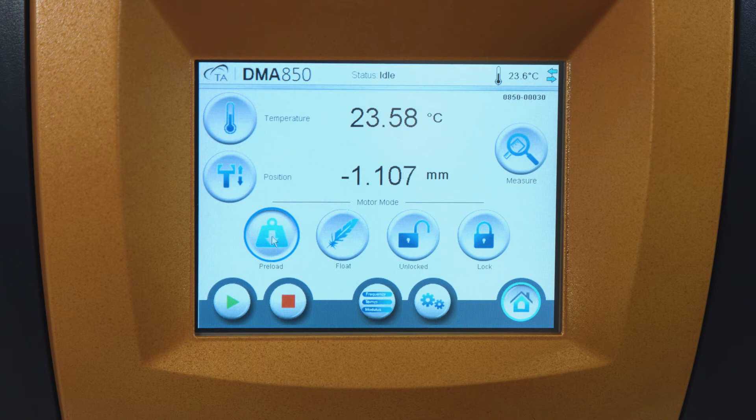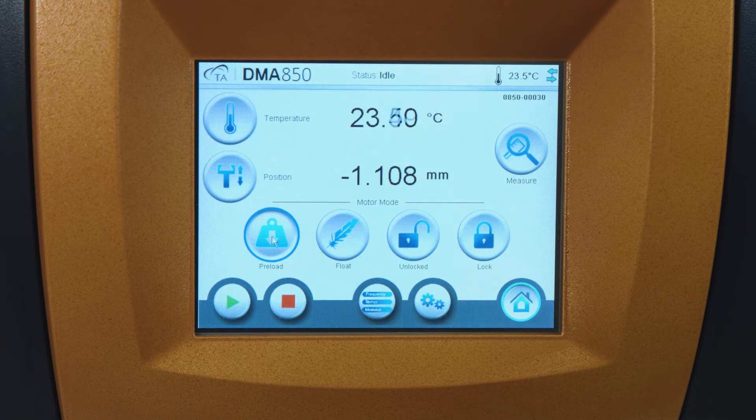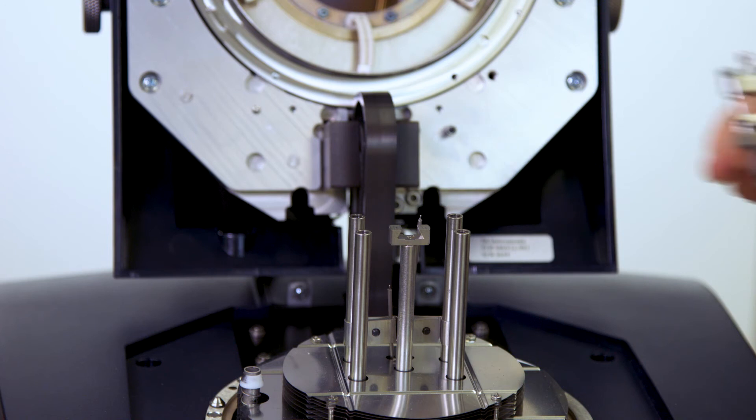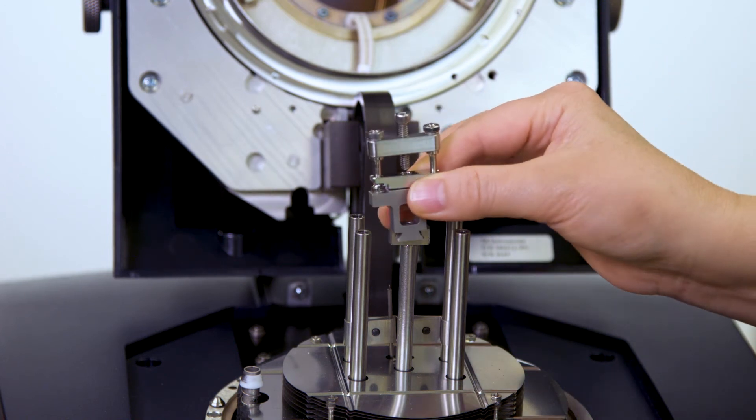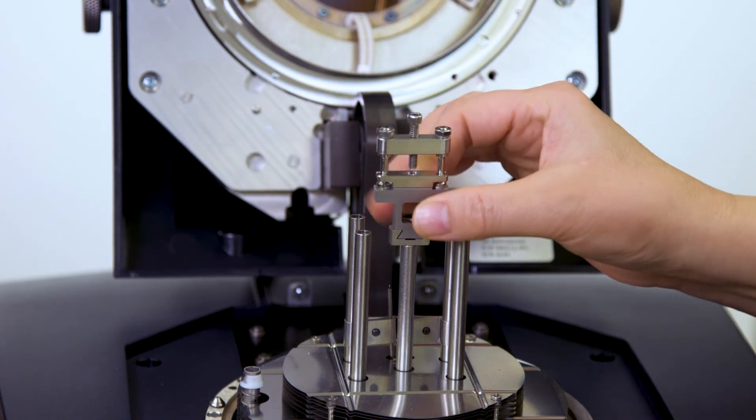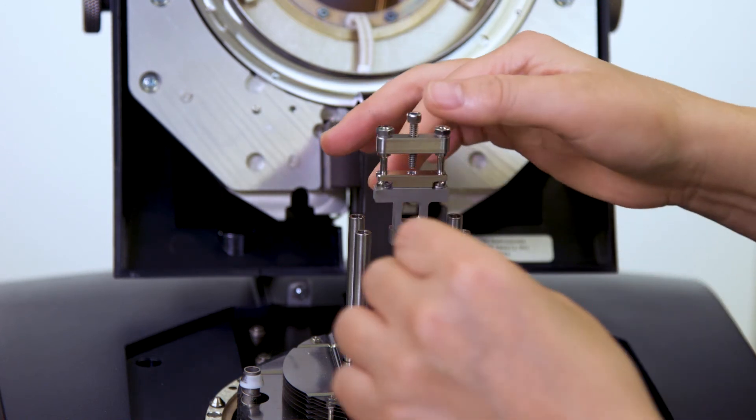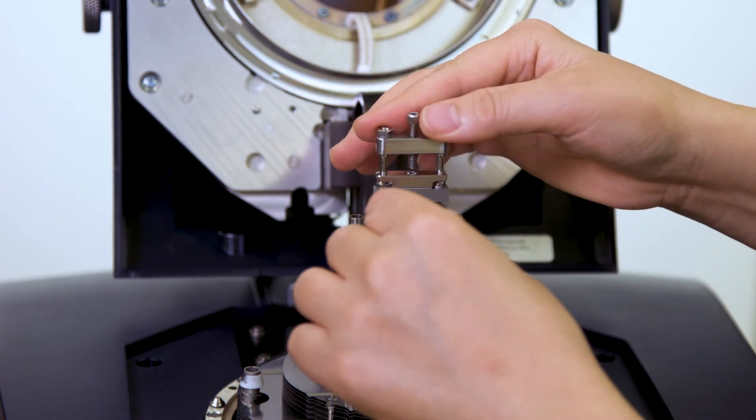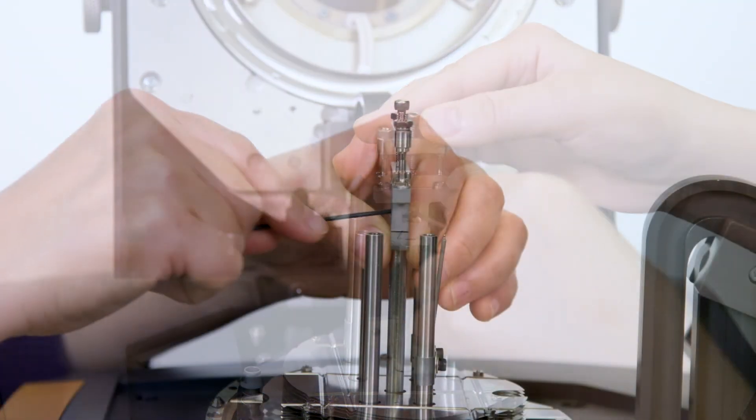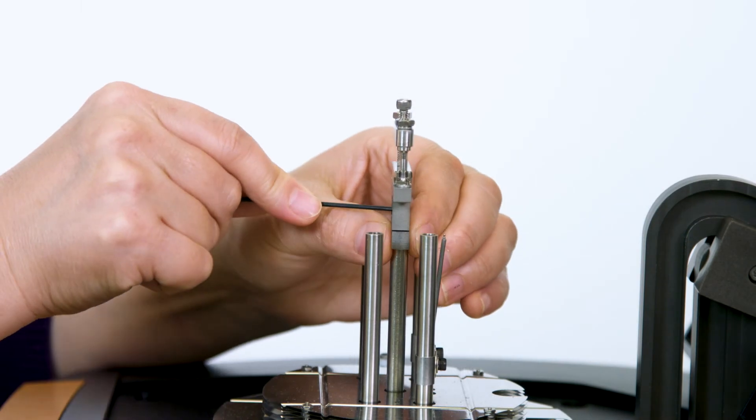From the instrument touch screen, lock the drive shaft. Install the movable clamp to the drive shaft. Then, close the furnace.